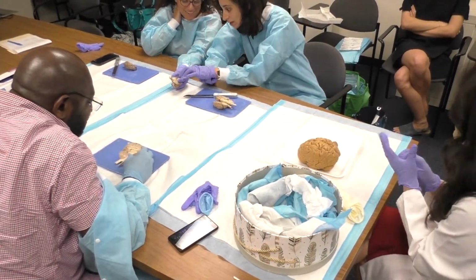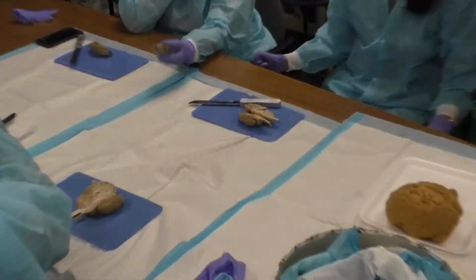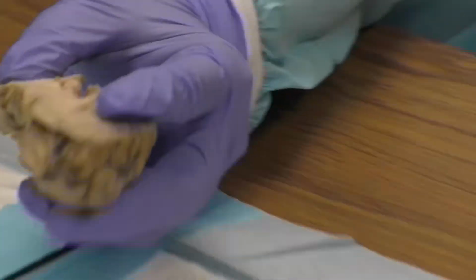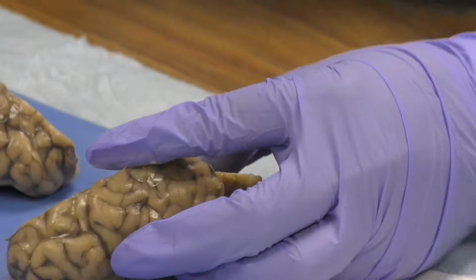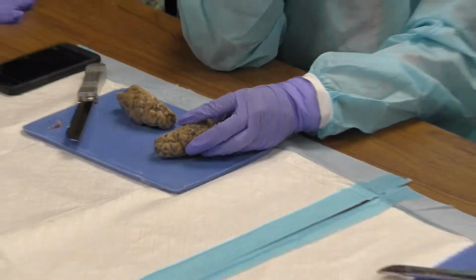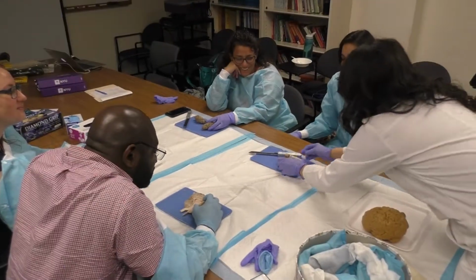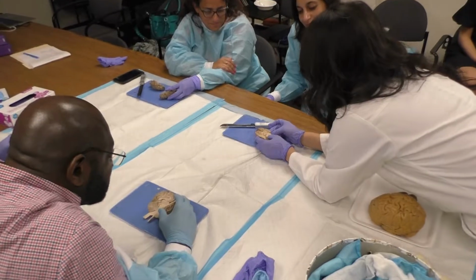Oh, there it is. Look how big it is. It's relatively big in the sheep brain. Is that centered, or does it skew to one side? It's centered. My knife just skewed fortuitously. Okay. Next, we're going back to the next bump down.